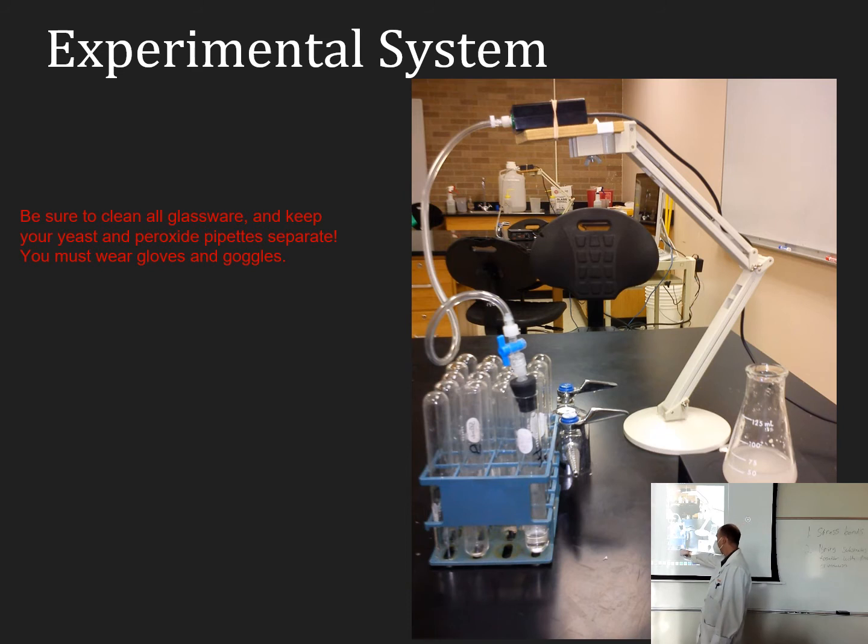So the basic idea is when we put yeast and peroxide together in this test tube, we're using yeast as the organism today, the model organism. Because yeast is a eukaryote, just like you. It has all the same organelles you have, including peroxisomes. And those peroxisomes contain catalase. It's just bread yeast that you get at the store. It's a fungus, a single-celled organism that contains peroxisomes just like you, which have catalase inside, this enzyme that we're studying. So we're going to use them because it's readily available. It's easy to maintain in the lab.